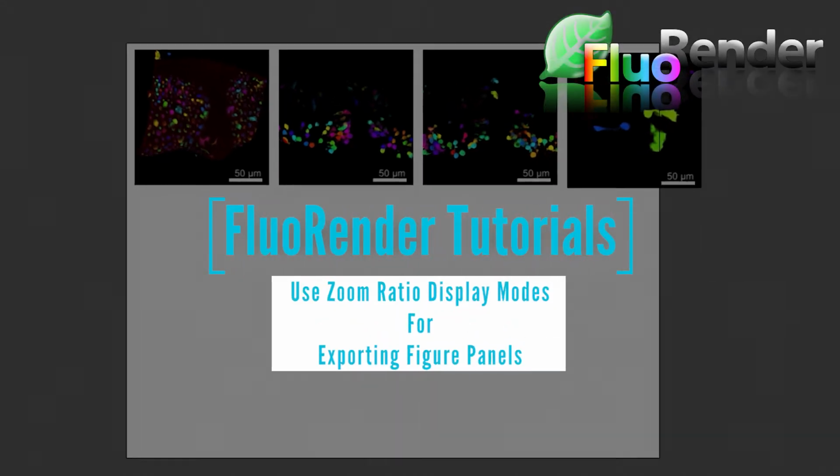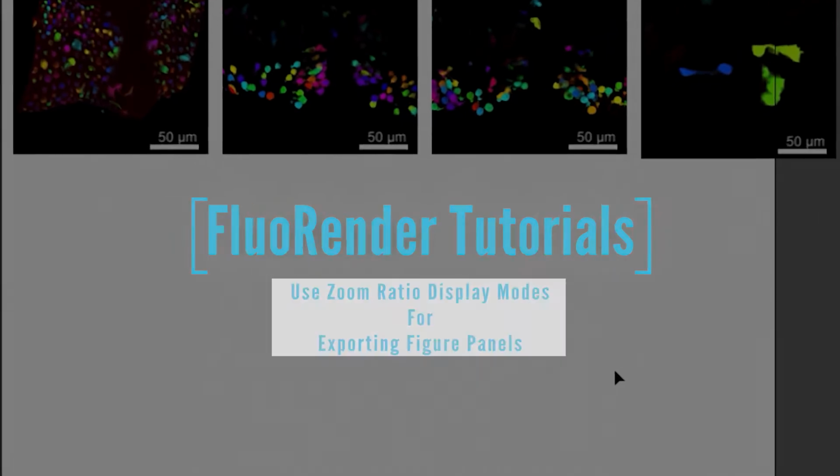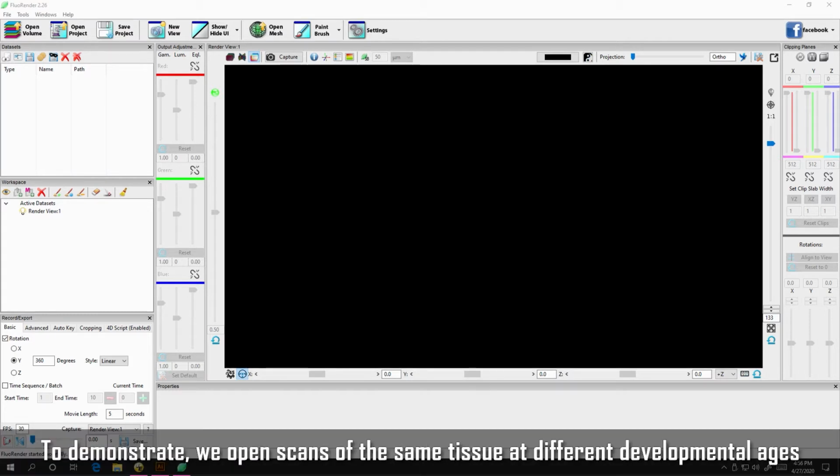FluoRender tutorials. Use zoom ratio display modes for exporting figure panels. The zoom ratio modes in FluoRender can be useful for exporting a series of renderings. To demonstrate, we open scans of the same tissue at different developmental ages.